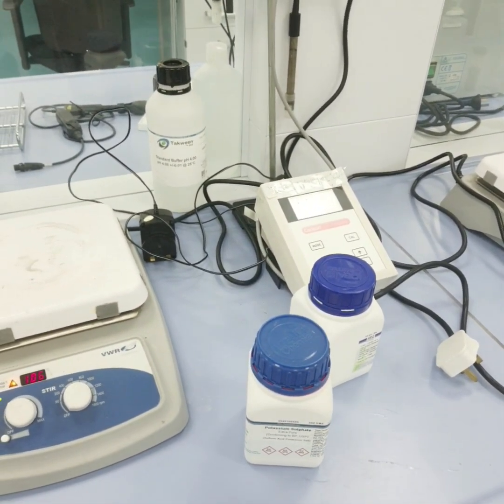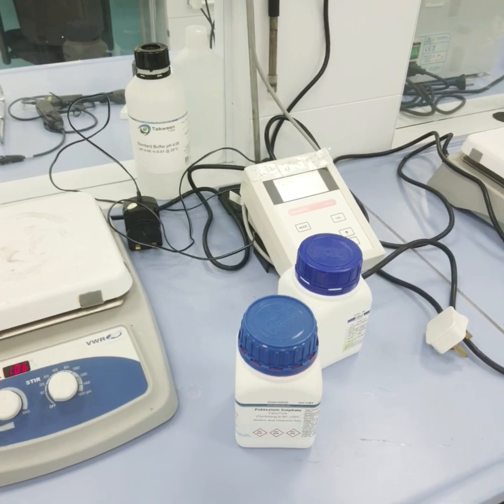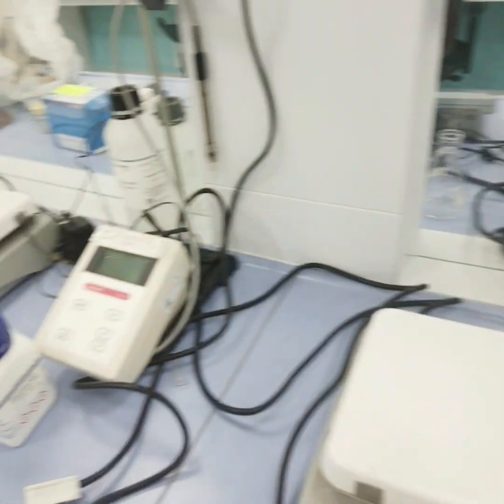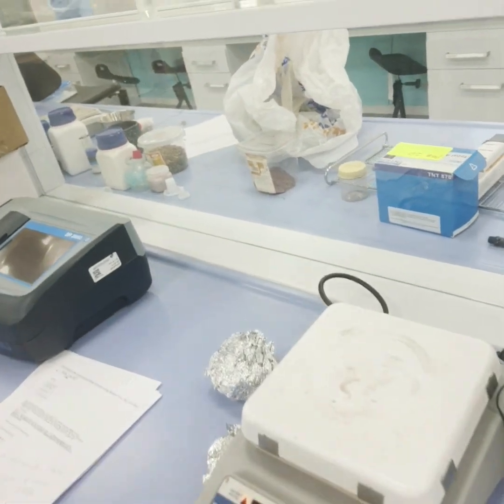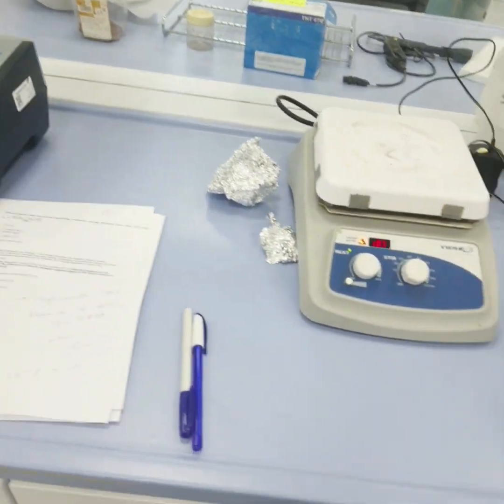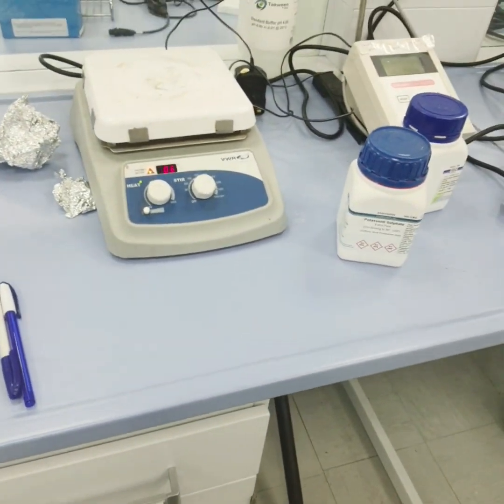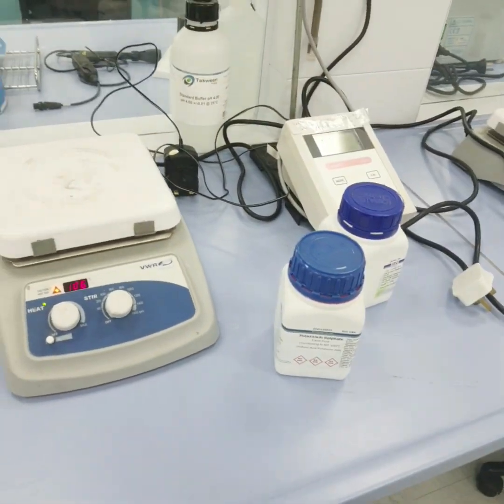So the hardness of the water is of two types: temporary hardness and permanent hardness. Temporary hardness can be removed by boiling, and the permanent hardness cannot be removed by boiling. For that we need special procedures like ion exchange and other techniques also.